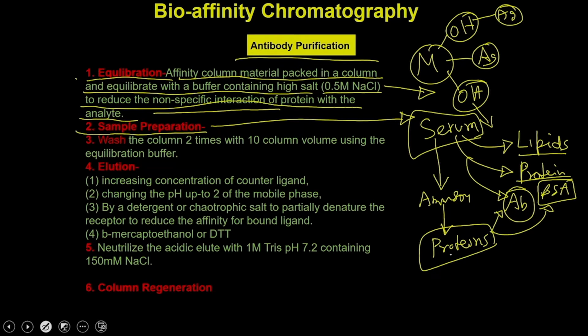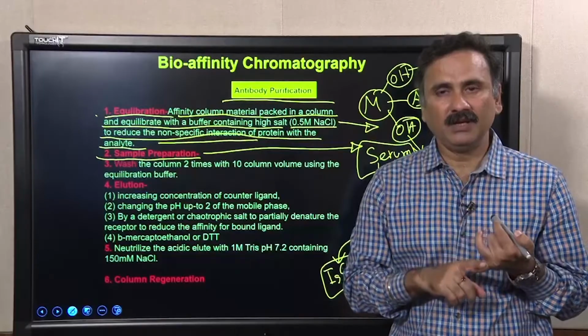After that you can do another round of ammonium sulphate precipitation, so that it only gives you the IgG fraction of the serum, and that is partially going to concentrate the samples, number 1.